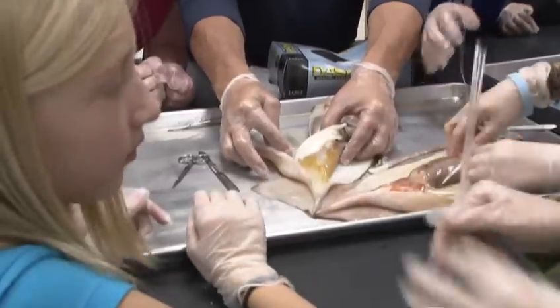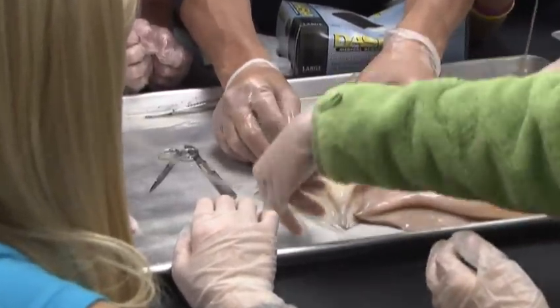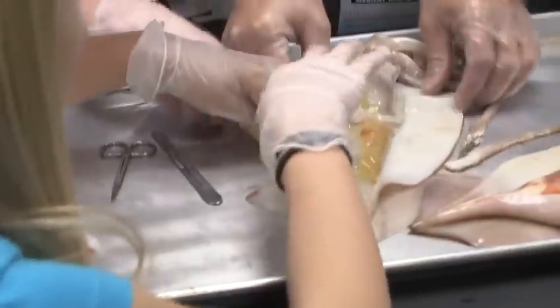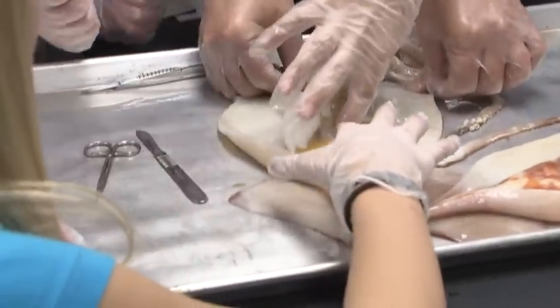You see this stuff right here? Look, it looks like saran wrap. Yeah. That's called mesentery. It ties everything together in your body too. Yeah, you guys can touch it, sure. What's the white stuff? I'm going to tell you in just a second here.